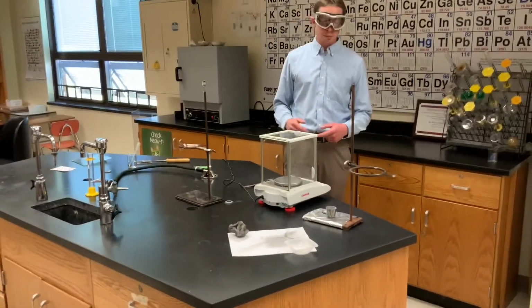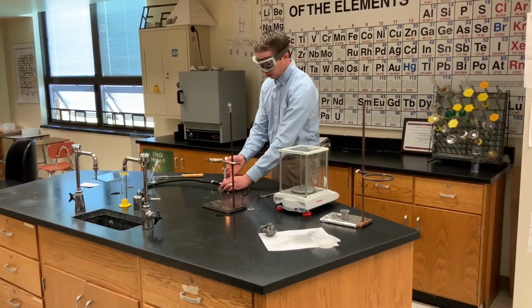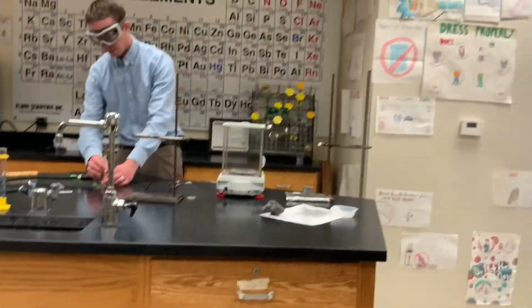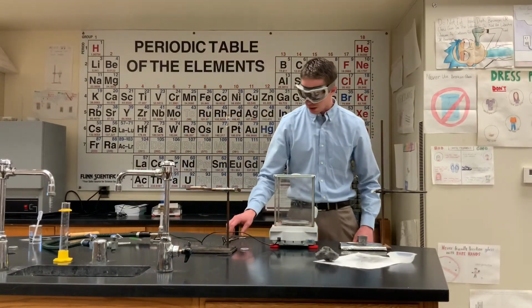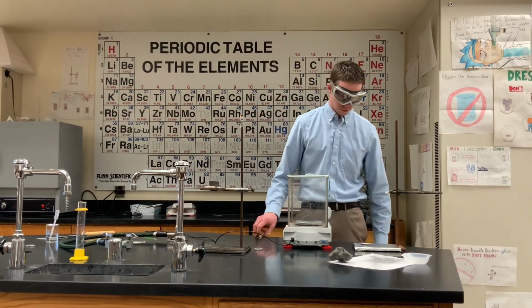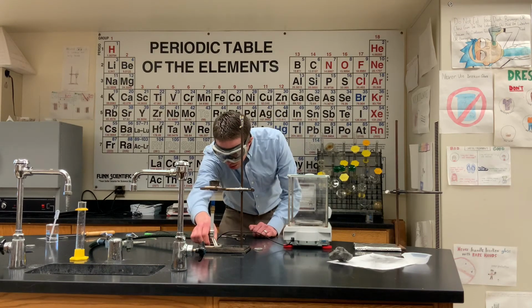All right. So here we go. I'm going to fire up the Bunsen burner again, and then put it back on the heat to drive off any water. Close, close. Slowly open the gas. There we go. That's some oxygen. And put the crucible back, put the lid partially on so we don't lose any product, but also allow the water to escape. Hit it with the heat.